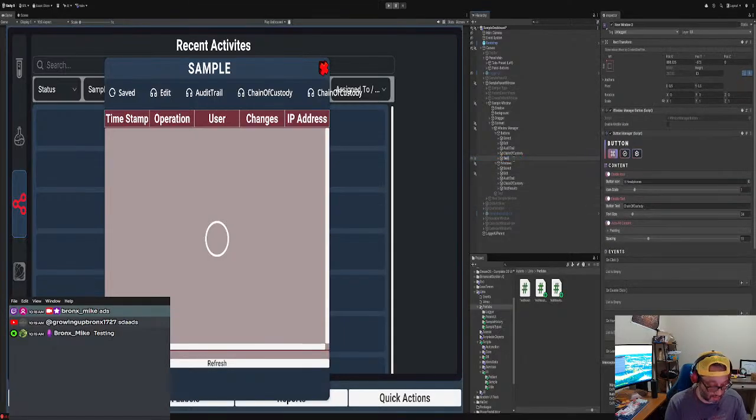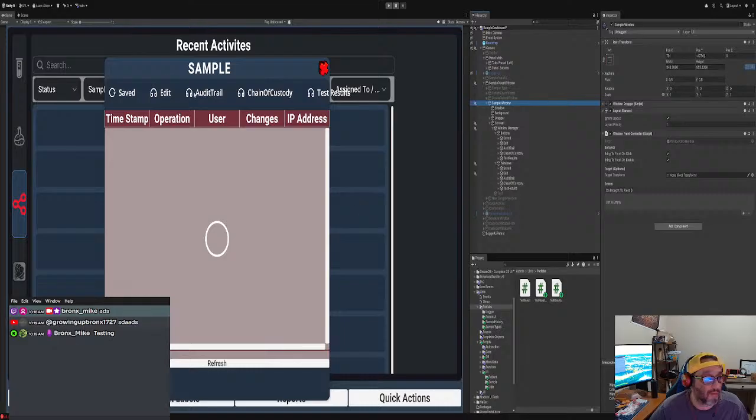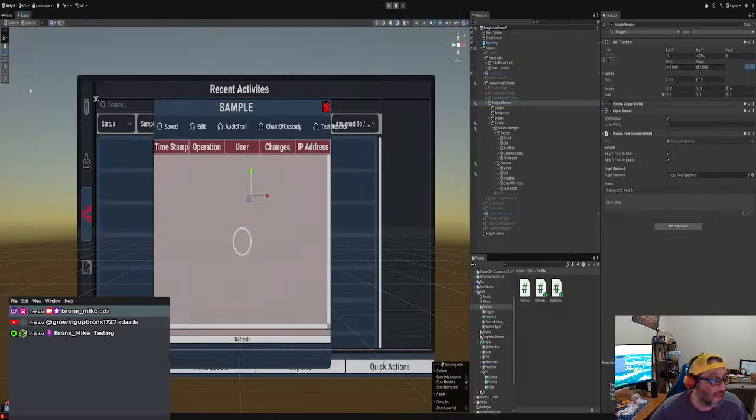Test results. Okay. Test results, right? So that's our button, right? And we need to name that test results again. If these buttons are getting too big, you have a couple of options. What you could do is you could either make the window a little bigger or reduce the size of the fonts. I chose to make the windows a little bigger. Well, actually, no. Let me see. Is that working well? No, not really. Oh, there we go. Yeah, it saved it.